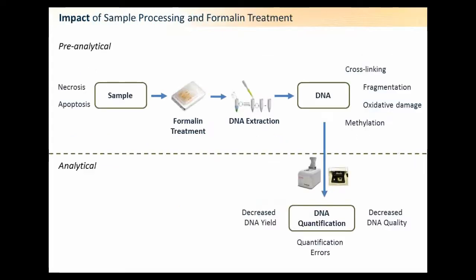So bringing this all around, and to bring it on the topic of this webinar, you have at the start, in the pre-analytical step, and I'll try and use the mouse so you can see where I'm talking. As soon as you take your sample from your patients, as soon as you've opened them up and they're under surgery, that sample will be undergoing various oxidative damage. And that can then potentially induce apoptosis, or could go through necrosis. You're then going through the formalin treatment to generate your FFPE blocks.